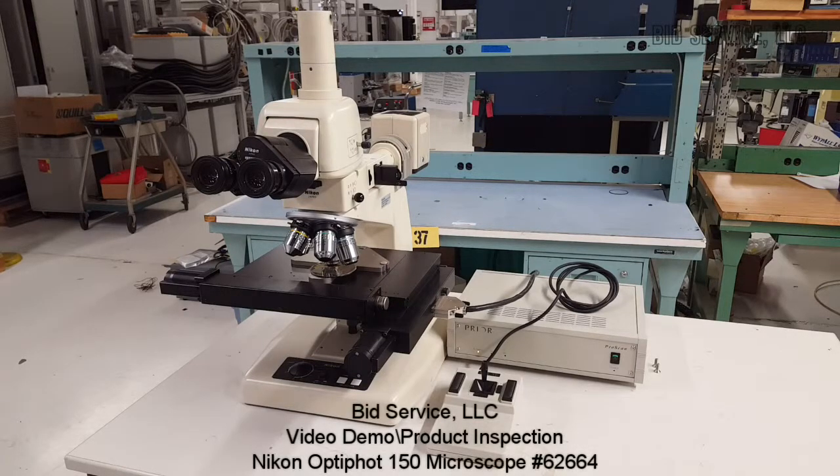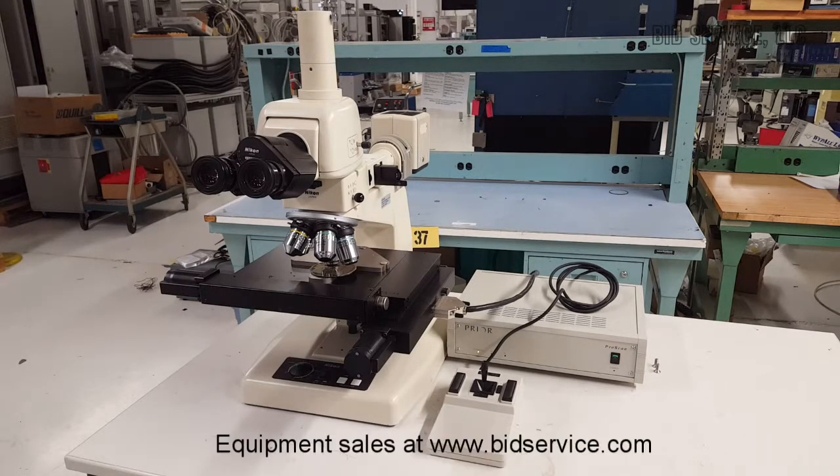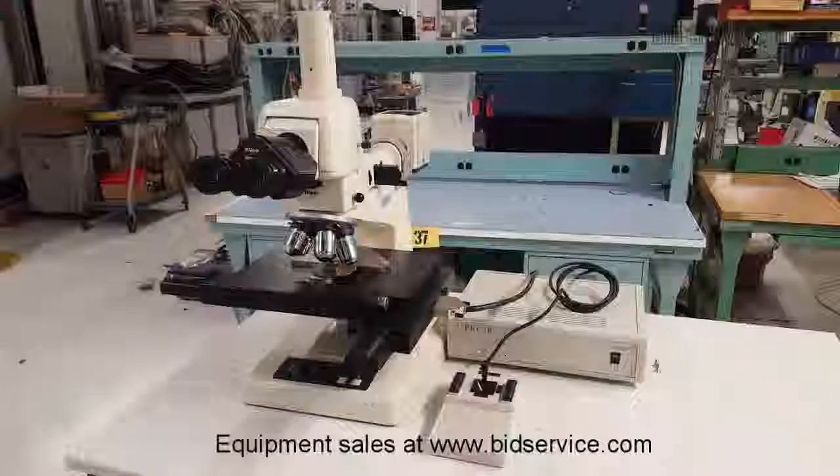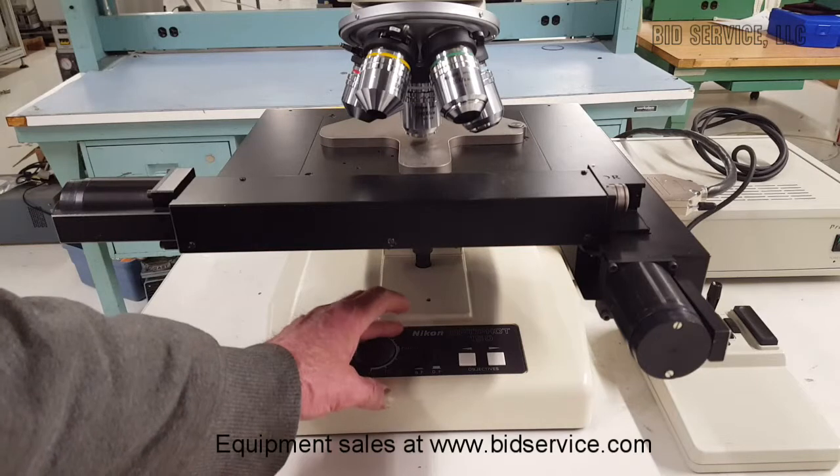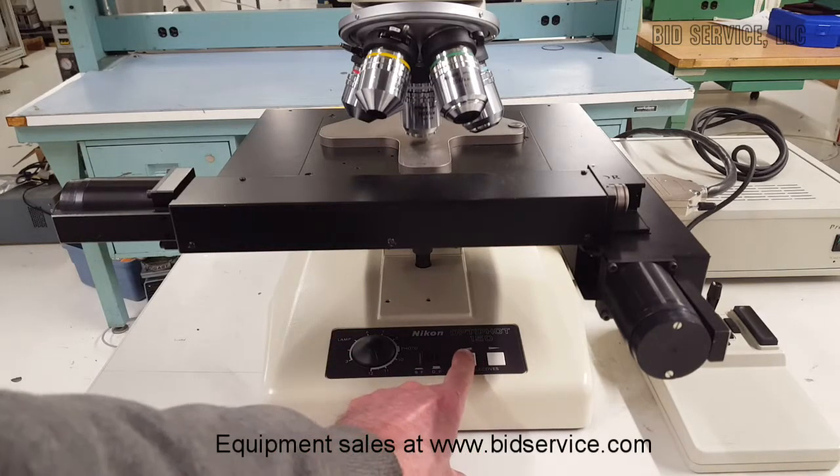Here we have the Nikon OptiPot 150. It has the prior motorized stage. Here on the base is the light brightness knob, and here are your objective buttons.